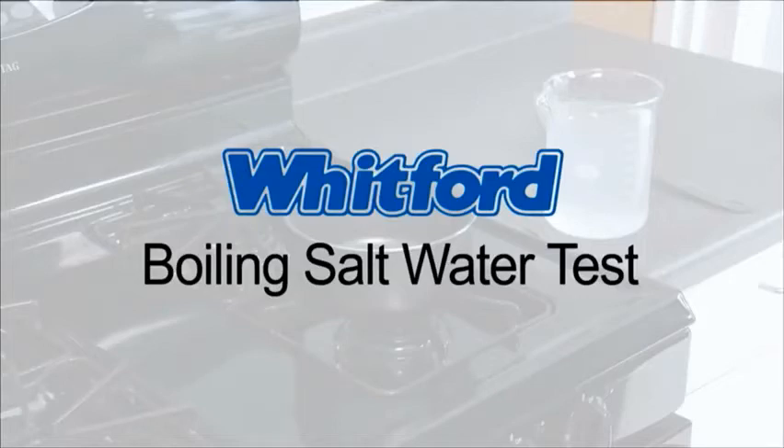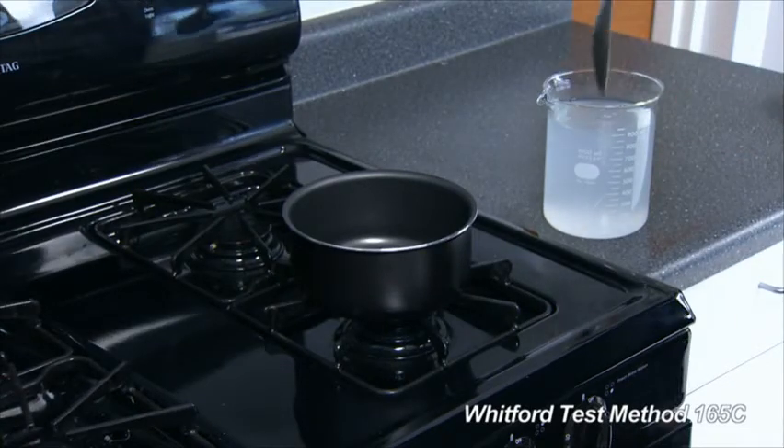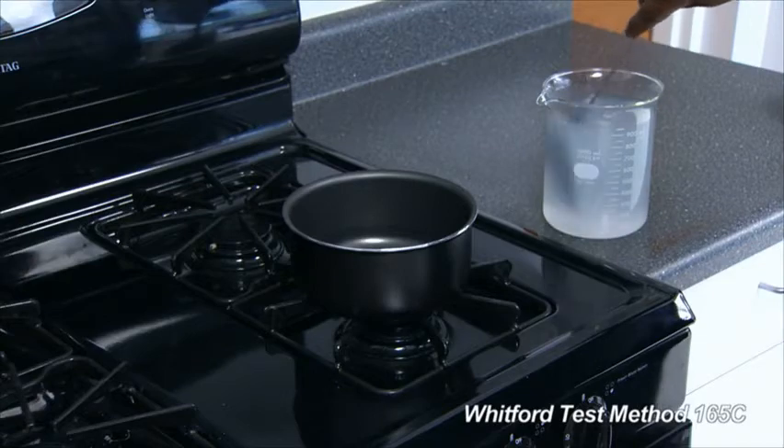This is Whitford's Boiling Salt Water Test, a procedure that evaluates the corrosion resistance of coatings. Prepare a solution of 10% salt in distilled water, dissolving the salt completely.